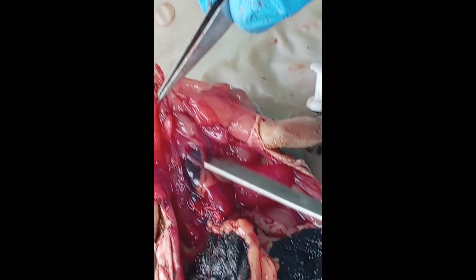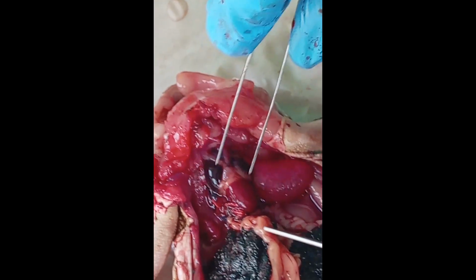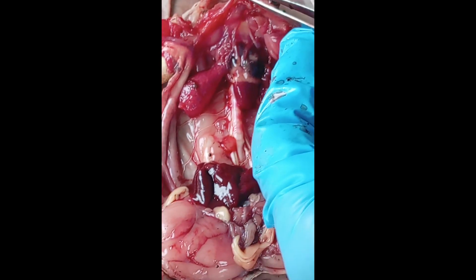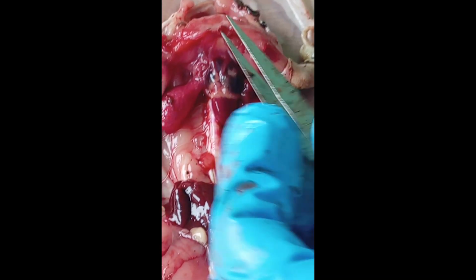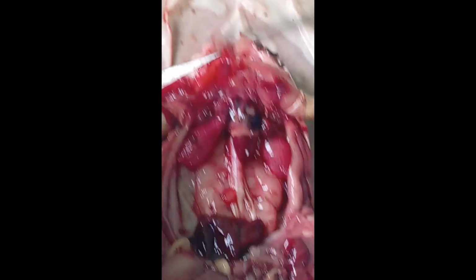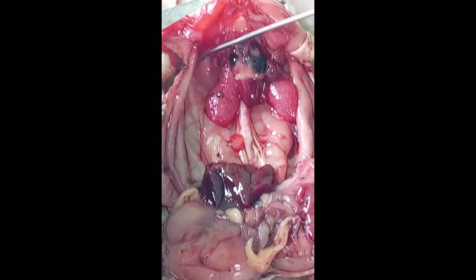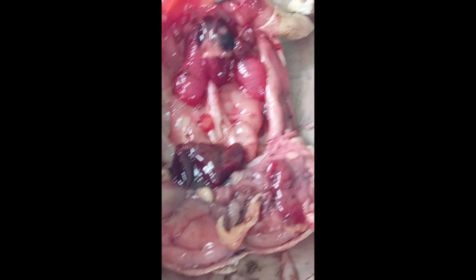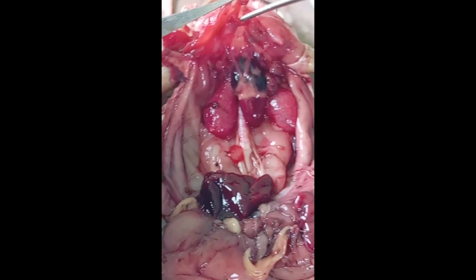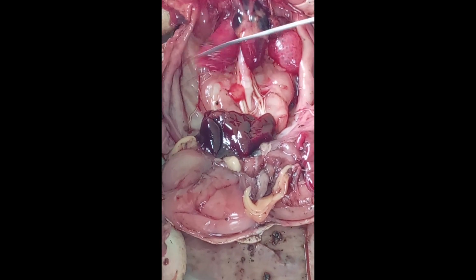You will see that there is a membrane, that's the heart. See, that is what looks like the xiphoid cartilage. But you can see the heart there. You can also see the two lungs in the area, and that is the thoracic cavity. Very clear. Now, this structure separates the thoracic cavity from the buccal cavity.